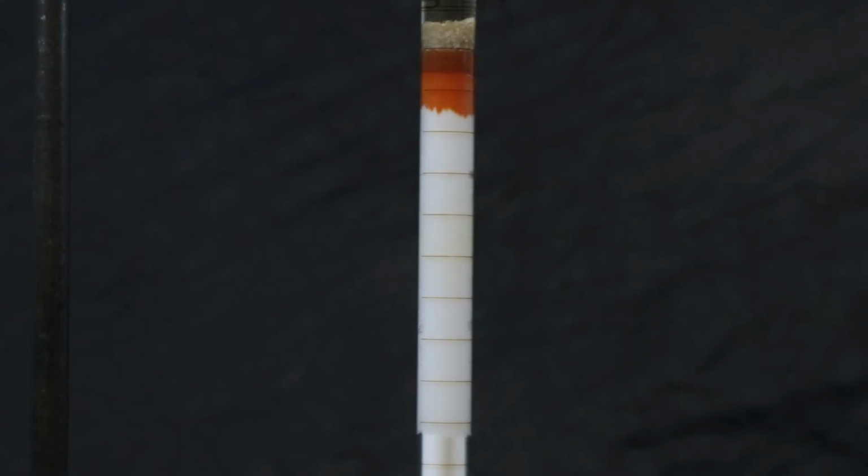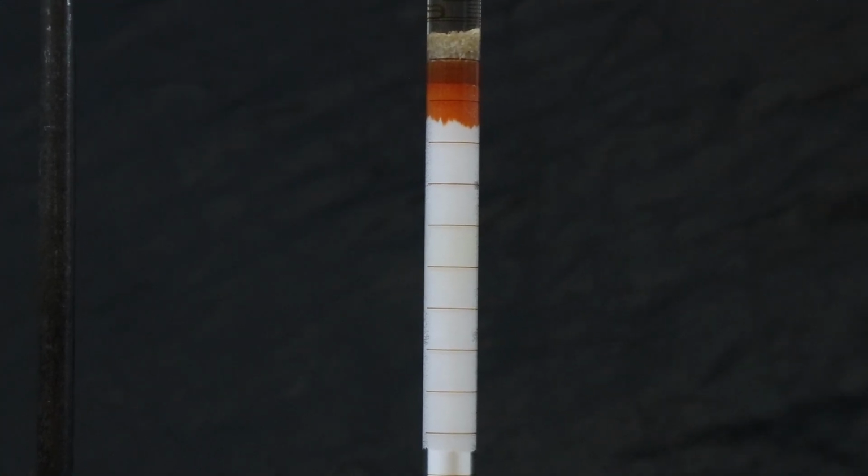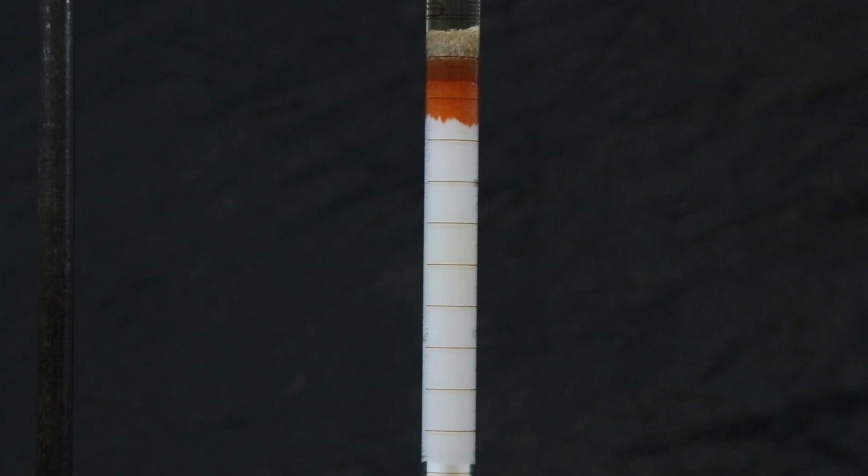It is really hard to see in this shot, but there's actually just a little bit of yellow color in the middle there, meaning that there's some ferrocene left over, and we can expect to see that coming out in the test tubes. But since there's a clear separation between the ferrocene and the products, I can go ahead and move on to the second solvent now.